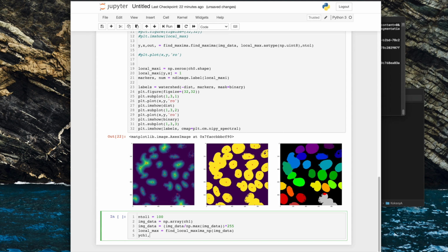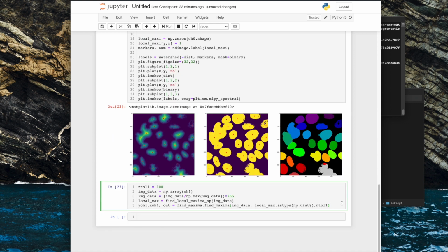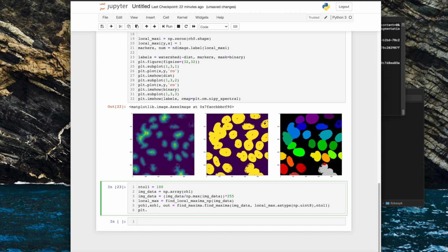And then we're going to store the outputs that we want as something unique. See, I'm using the same variable names as before, which we've just overwritten, but that's fine because we're just using a lot of them temporarily, and I've given the outputs a unique value. Okay, that seems to have worked. So if I just plot quickly what that looks like.